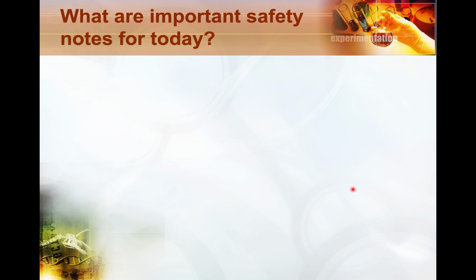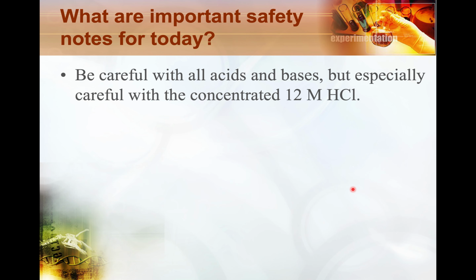So now that you know everything for what the purpose of the lab is and what you'll be using, what important numbers you should be writing down during the lab and how you use that in the lab report, I want to go over some safety concerns for today. There's a lot of acids and bases today, so be very careful with any solutions you use.